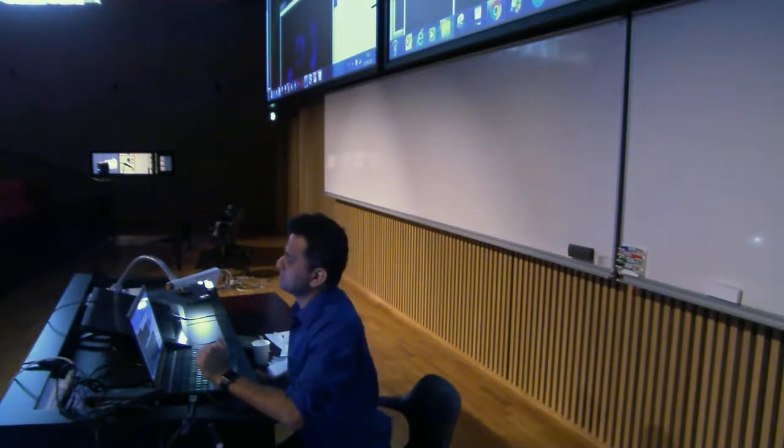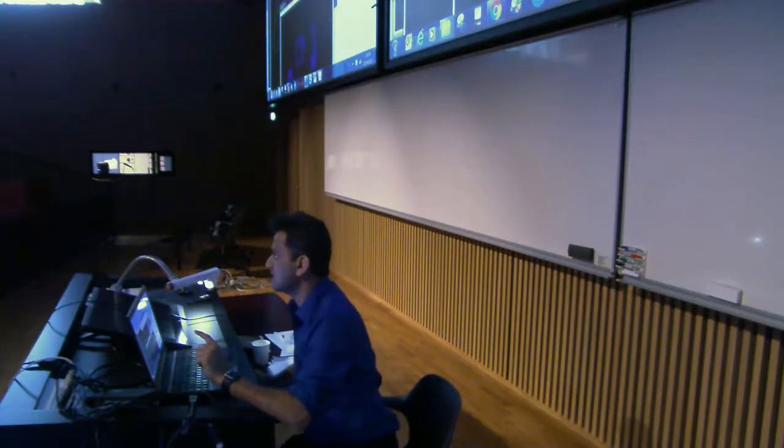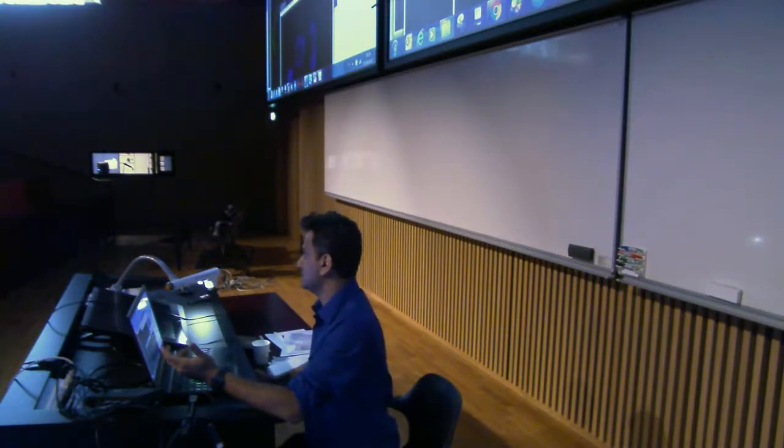Dror asked me one question: isn't it possible, because the image I have acquired is from a vendor-specific microscope, to just drag and drop and there is no need of checking the metadata, whether or not it's calibrated? What happens sometimes is that ImageJ reads metadata from your file, and because ImageJ is software, sometimes it may not be able to read the entire metadata. So it kind of screws up the metadata, and because of that your calibration will be off, will be misleading.